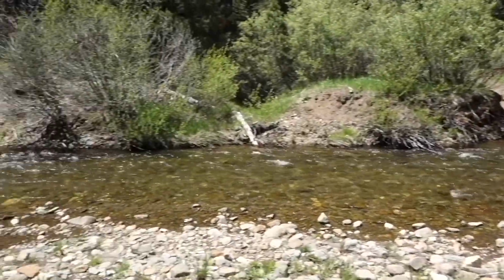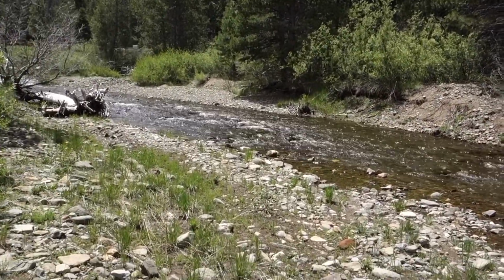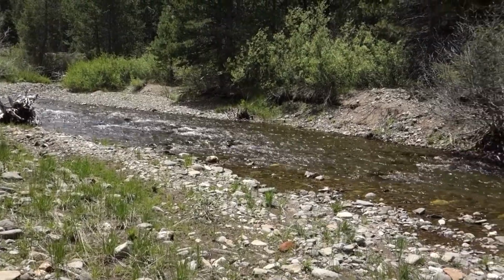Okay, so dissolved oxygen is a measurement of how much oxygen is in the water of the creek. Higher amounts of oxygen is obviously better for the wildlife and animals that live inside of the creek. So having that darker blue color is an indicator that we have a greater amount of oxygen and therefore a healthier creek. It changes along the creek how much oxygen is in. So in places where the water is moving, where you see that white water, that's an area where there's going to be a higher level of oxygen, and that's because the air from the sky is being mixed into the water along those white water riffles.